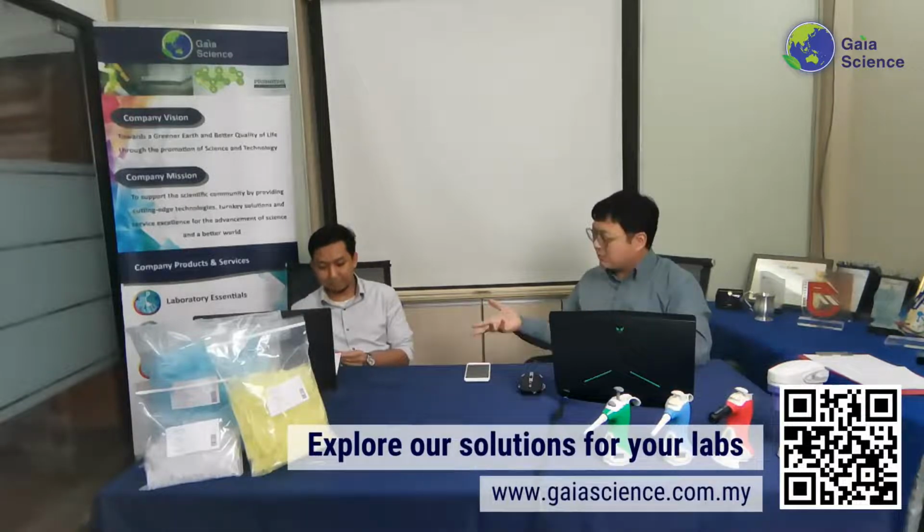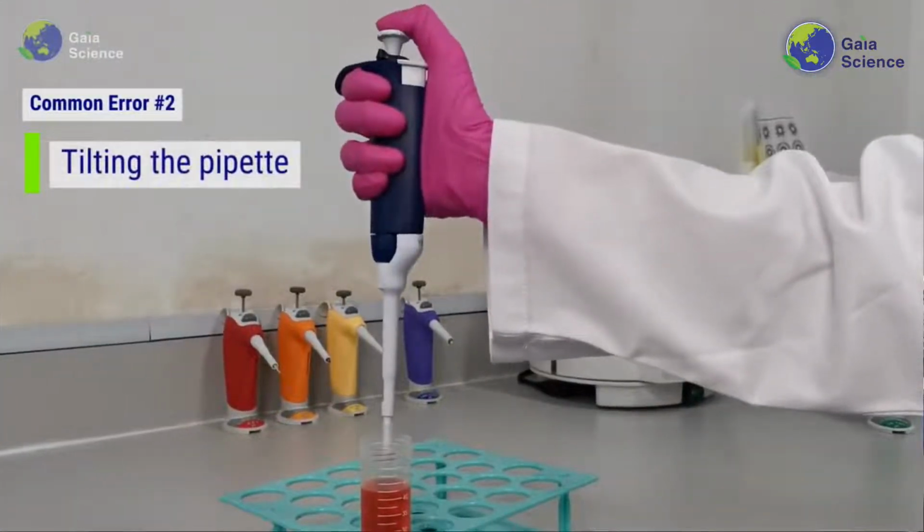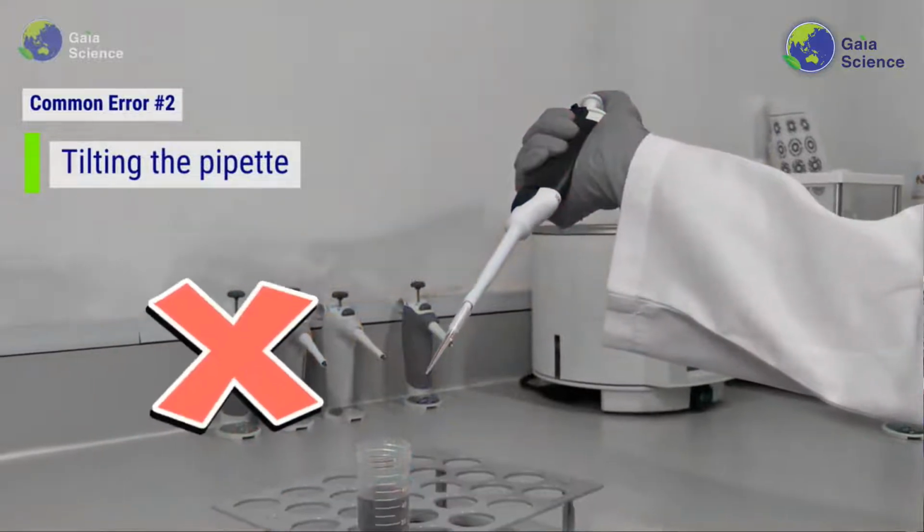You can say we took a lot of effort to list down a lot of different things that we have, including the ones that you raised. Bulk, rack tips, and others as well, sterile, non-sterile, and so on and so forth. Hopefully some of the earlier videos that you've seen have shared a little bit on the proper techniques. But even though you have the techniques, if you don't have the right tips, then it defeats the purpose of having good techniques, I would say. So let's get right into it.